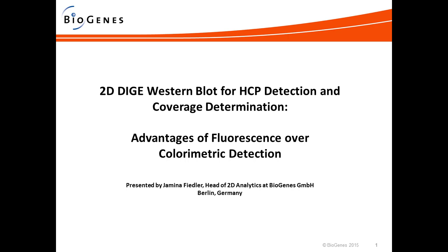Okay, and what software is used to determine the HCP coverage? The software we use is the Image Master from GE Healthcare. Our whole system is based on GE Healthcare.